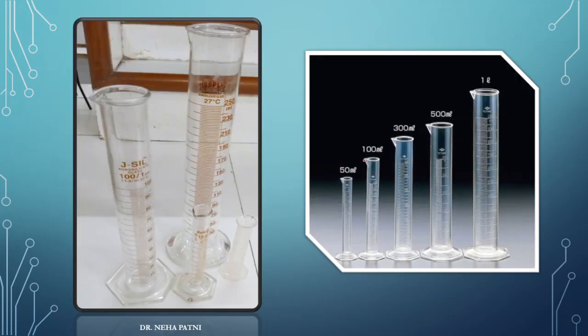As you can see, measurements are written here — obviously, it is a measuring cylinder. The name itself suggests it is used to measure the solution. You can see capacities of 250 ml, 100 ml, 10 ml. This one is of plastic, this one is of glass. Measuring cylinders are available in the lab; whenever you have to measure a certain quantity, you can use them.